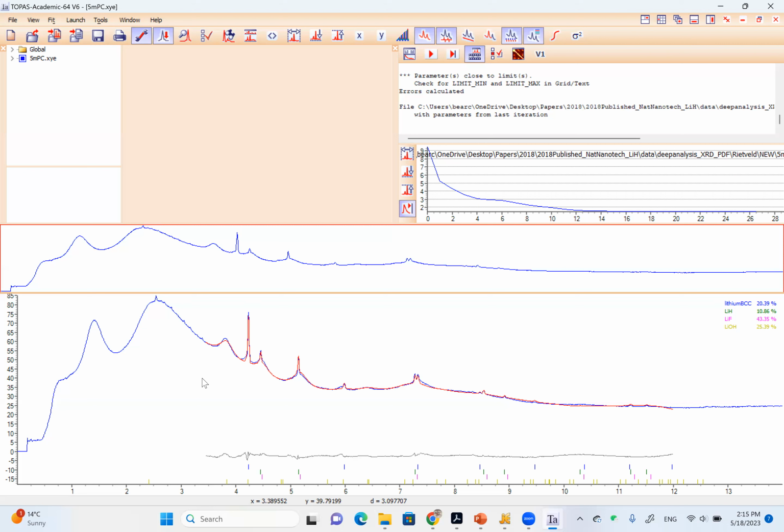And second of all, our focus of analysis of the diffraction data is on the crystals. So we mainly focus on the crystalline parts. We do not have to include the broad amorphous peaks. That is making the job much more challenging and quite not worth it.